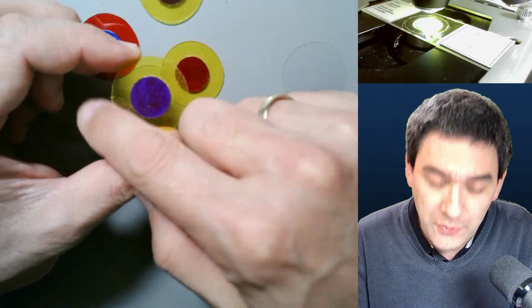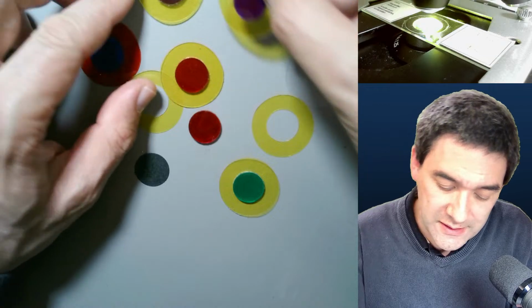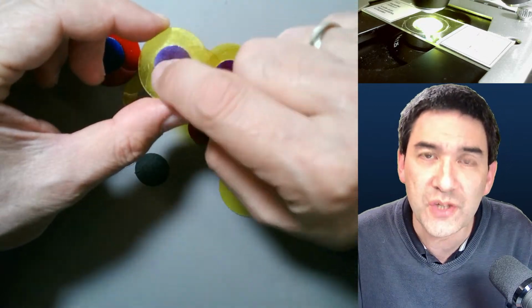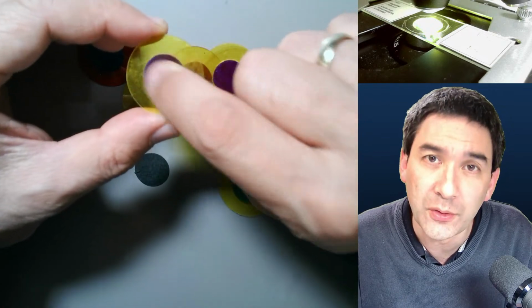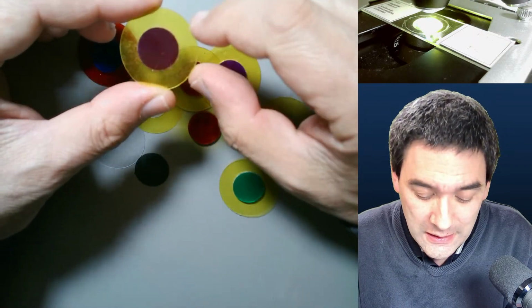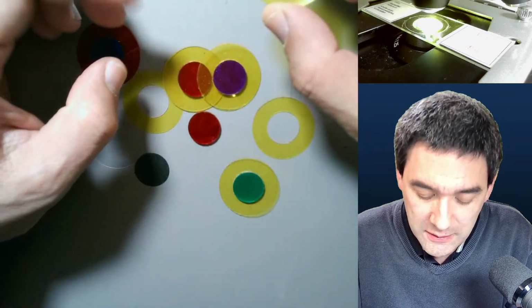And how do you get those circles? They were punched out. Yeah, and you can of course also cut them out yourself. But one of the things that's really critical, and that's where you have to experiment around, is that the size of the central disc has to be correct. Because if it is too small, you're not going to get a very strong effect. Yeah. So in case of doubt, it's probably better to make it a little bit larger, to basically err on the larger size, right? It will basically make everything a little bit darker, but at least you will get a good contrast. Yeah? And you can basically choose any color combinations.